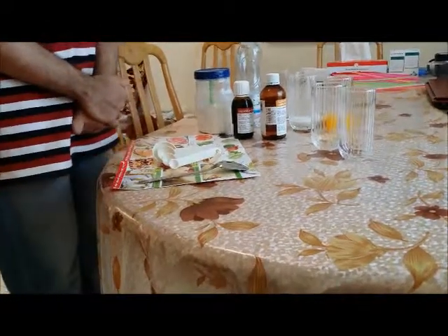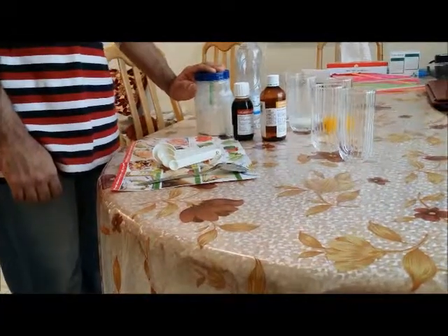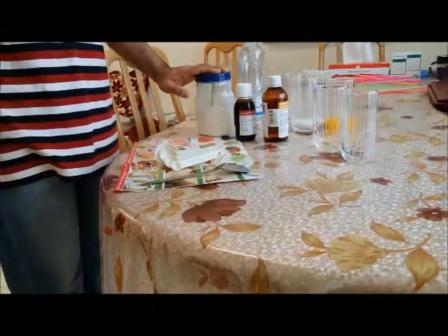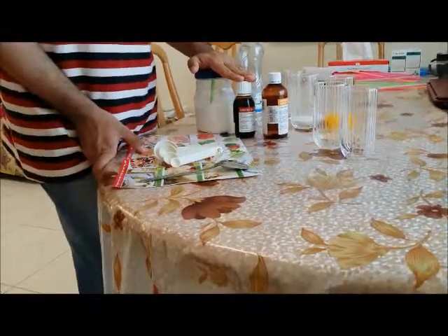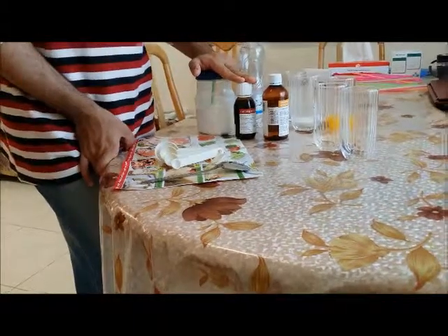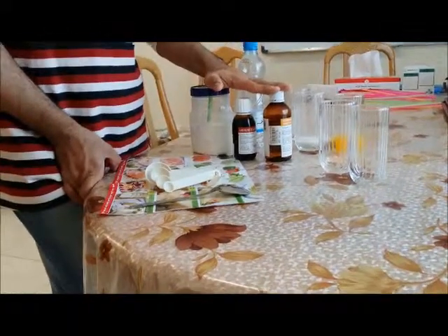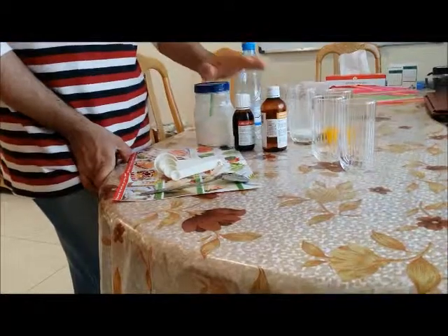Here the materials required for the experiment are cornstarch powder. If you are doing this experiment in a laboratory, then you can use normal starch, which is the chemical one available at your labs. Iodine solution, which is the normal one you can get from the pharmacy. If not, in the school lab, you can use potassium iodide. Hydrogen peroxide, commonly known everywhere in the lab, and you can get it in pharmacies.